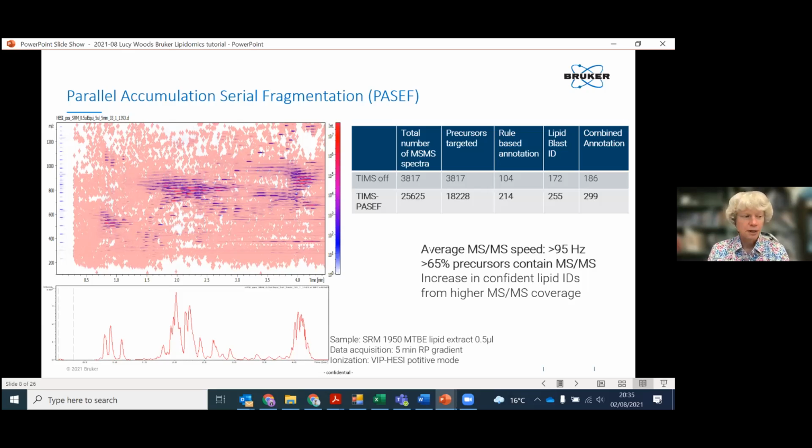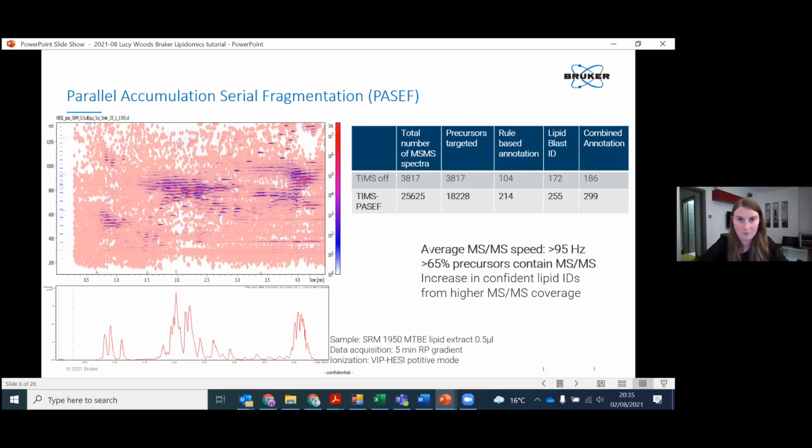And speaking of peptides, I have a question. It's peptides, not lipids, but it's about the use of isobaric tags with the timTOF Flex. I was told that the timTOF Flex has a bit worse mass accuracy than the Orbitrap, so that if you're doing TMT tagging, there are some TMT tags you can't use on the timTOF Flex that you could use on the Orbitrap. That's correct? Yeah, okay.